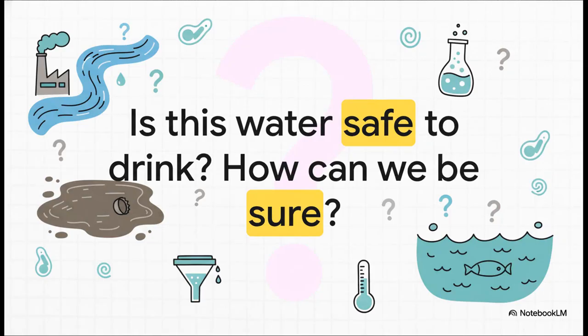Okay, so you've got this sample of water. Is it safe to drink? I mean, how can you be sure? It could be from a river, the sea, even a puddle. Just by looking at it, you have absolutely no idea. And that, right there, is the whole point of Required Practical 8.